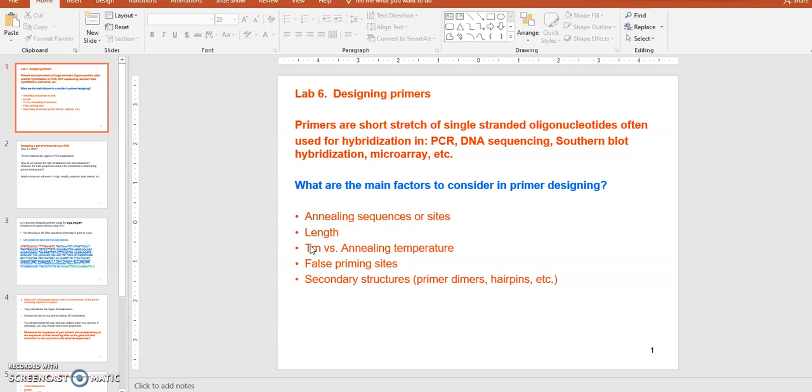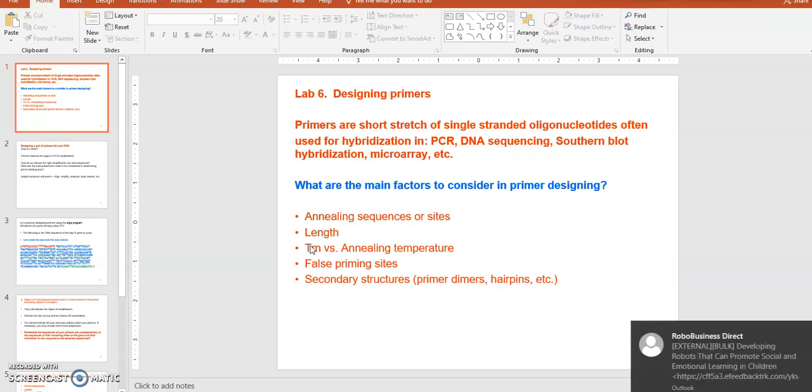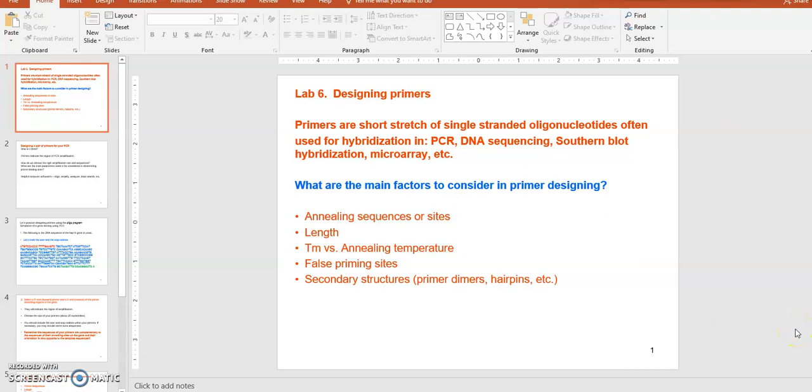your primer tends to bind at random locations, because your primer is short, about 21 nucleotides in length. There's a tendency that if there is enough DNA sequence match between your primer and the target DNA, like 50%, 30%, 20%, 60%, your primer will still bind on those sites. We call those random binding sites, right? And once your primer binds, when you do your PCR, it will work, right? Between those two primers DNA will replicate, so you will replicate so many random PCR products. That's not going to be good for your PCR purpose, right?